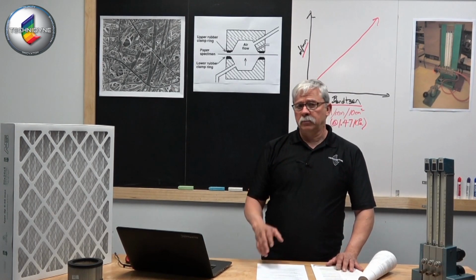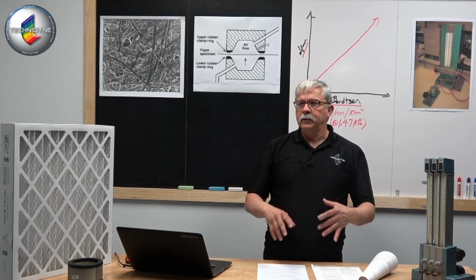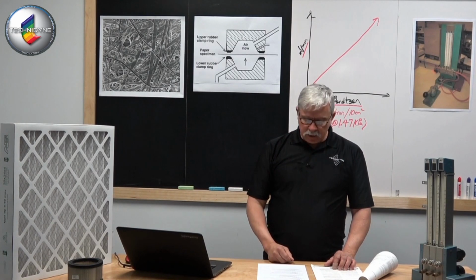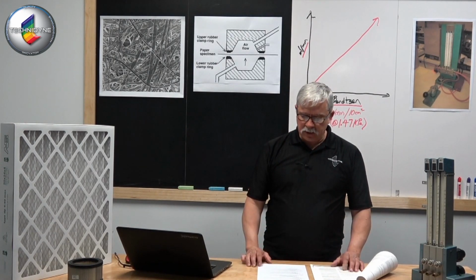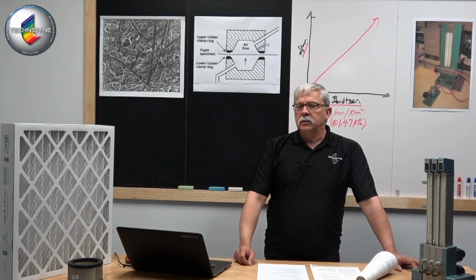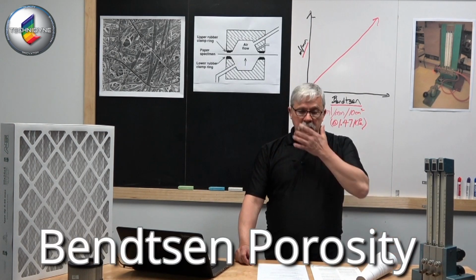Porosity measurement, air permeability, what have you. I gave you a definition of what porosity is, and a little bit of why we even test porosity and why it's important to our production people. Today I'd like my discussion to revolve around the Bendtsen test method.